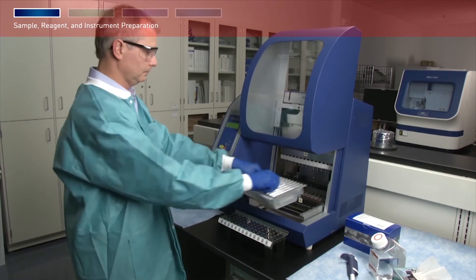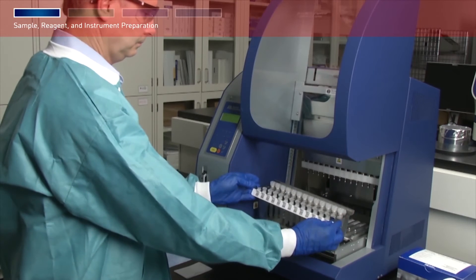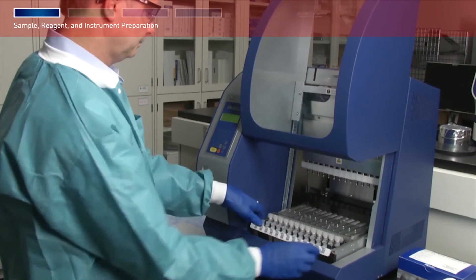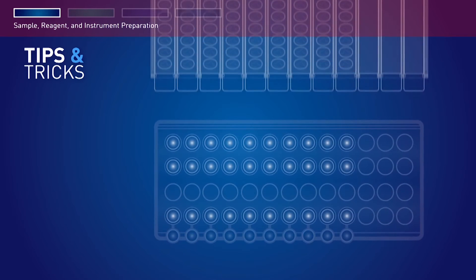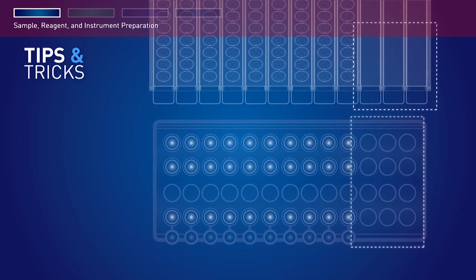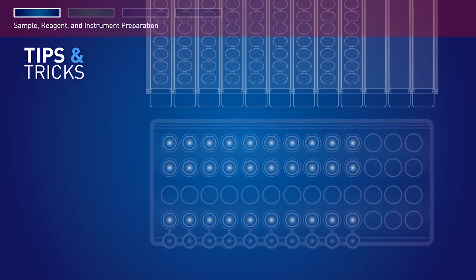Load the cartridge rack into the instrument first, followed by the tip and tube rack. Changing the order of loading the racks may cause the instrument to stop during a run operation. If you are processing fewer than 13 samples, make sure to load the tips and tubes in the same positions as the reagent cartridges that are loaded in the cartridge rack.